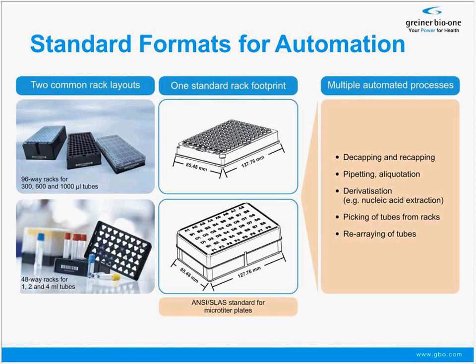If you have such standardized rack formats for your labware, for your biobank, they are prepared for a whole universe, let's say, of automated processes which you could theoretically apply. This is available to utilize this rack format, and they carry out processes such as decapping and recapping, pipetting and aliquotation can be done with these devices.